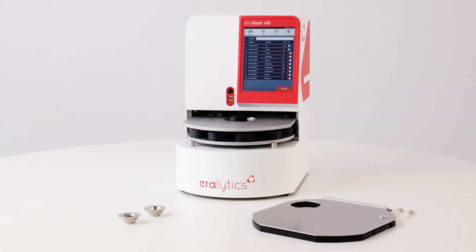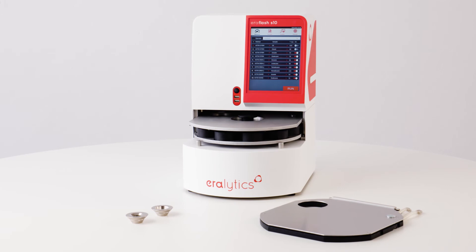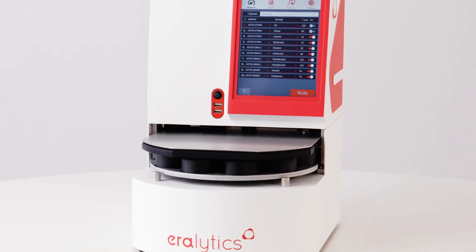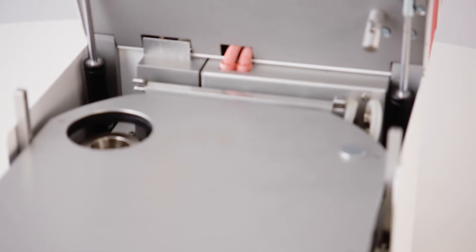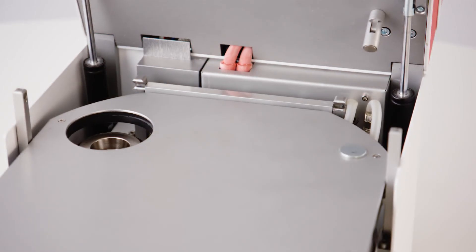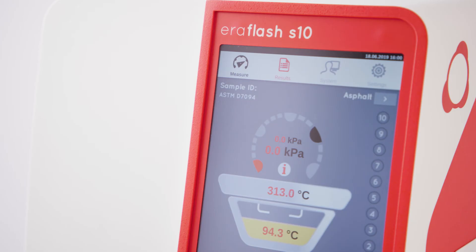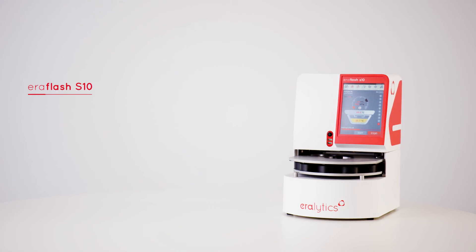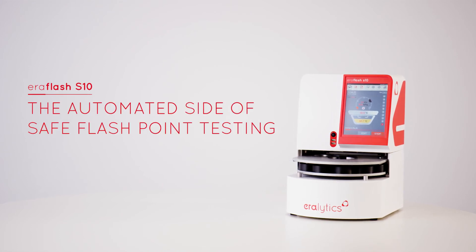Extended measuring options. The eraflash S10 can also be equipped with a cooling lid in combination with an external chiller for keeping the pending sample cups in a pre-cooled state, avoiding the loss of volatile compounds. A high temperature model for measurements up to 420 degrees Celsius. Stainless steel cups for corrosive samples. eraflash S10 – the automated side of safe flashpoint testing.